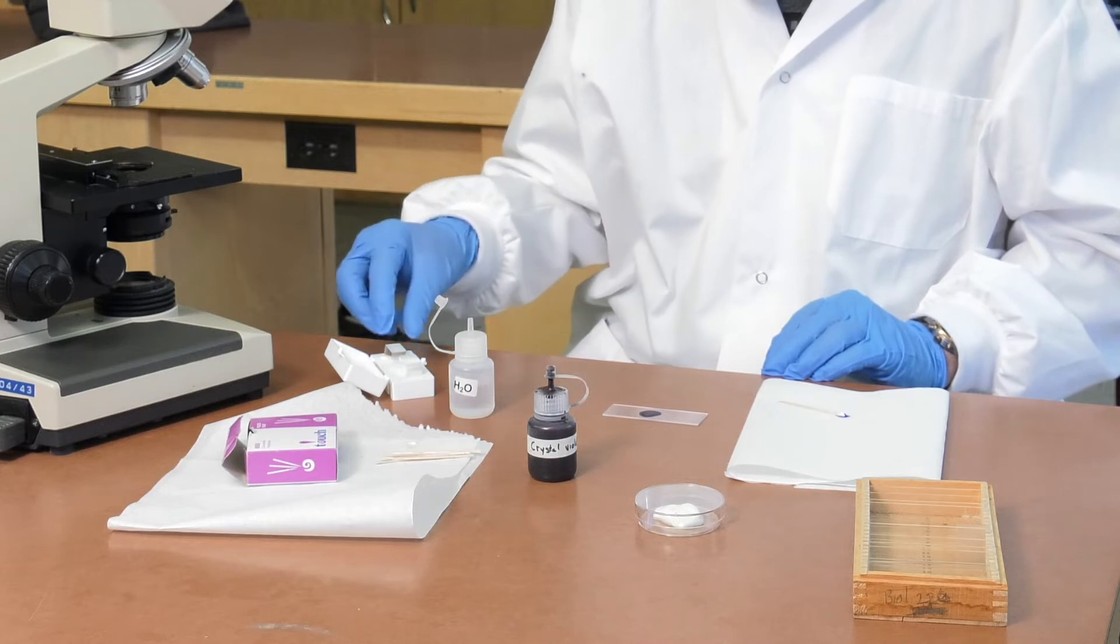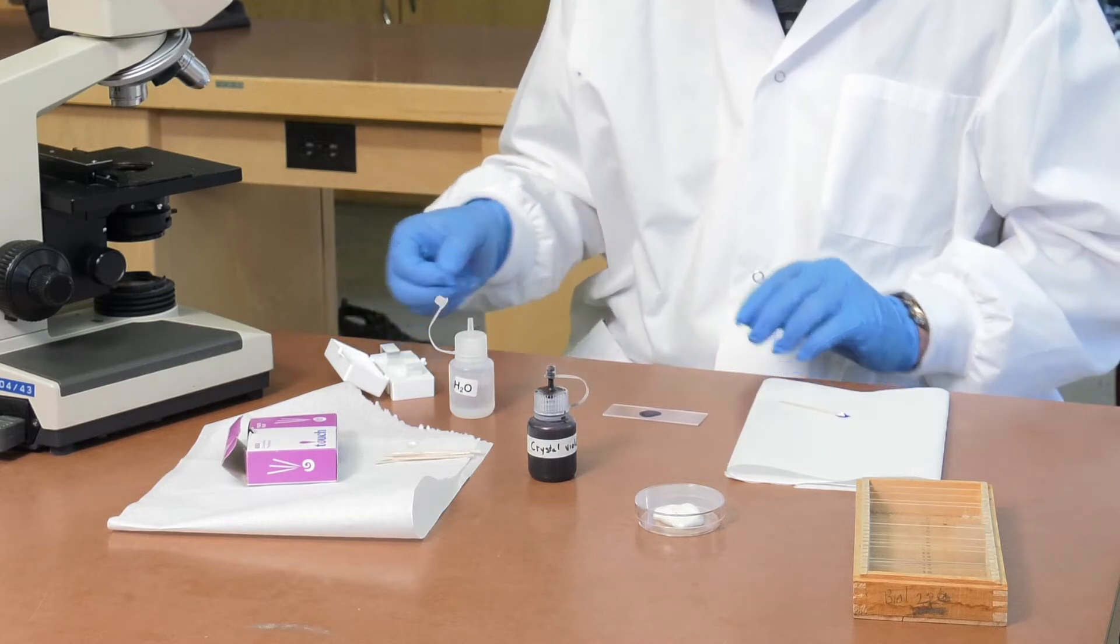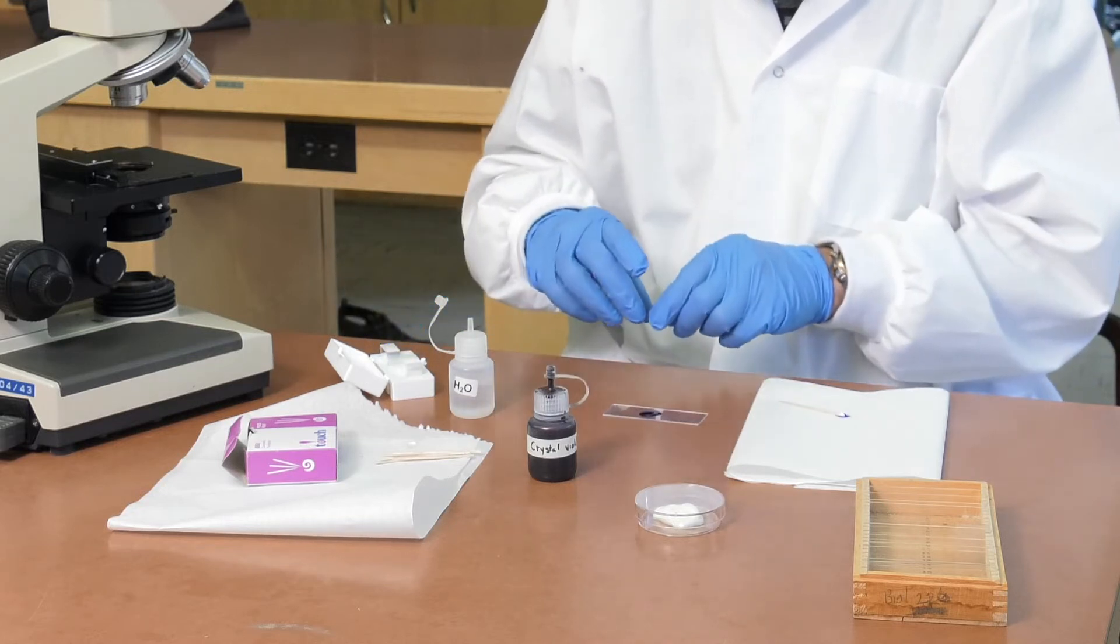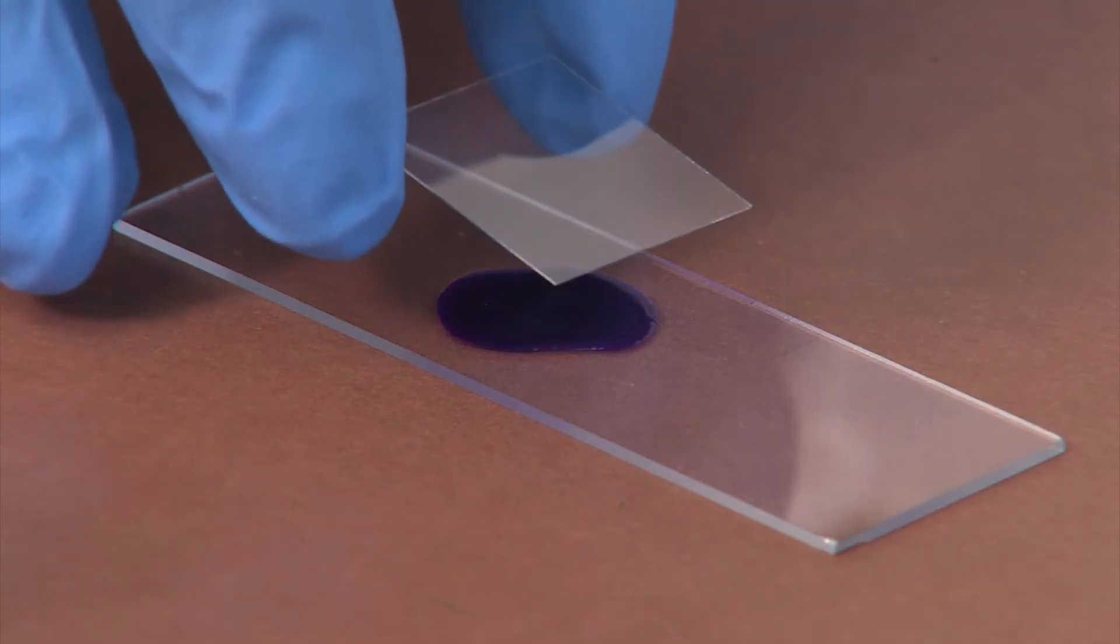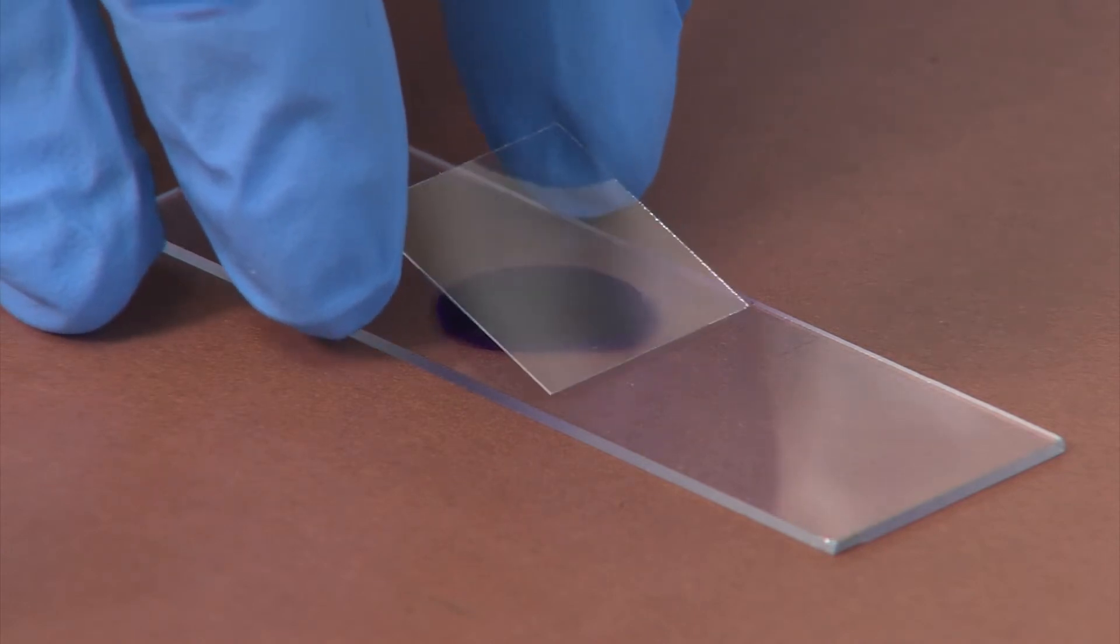Pick up a cover slip by the edges. Handle these carefully; they are made of thin glass and break easily. While holding the cover slip at 45 degrees, touch the bottom edge to the slide at the edge of the drop of stained yogurt.